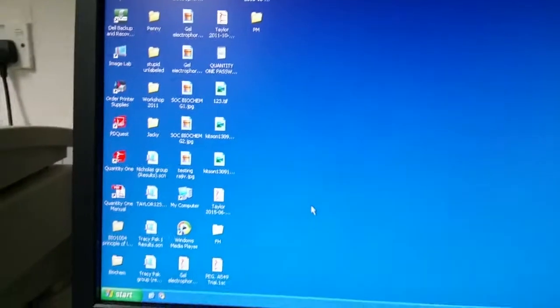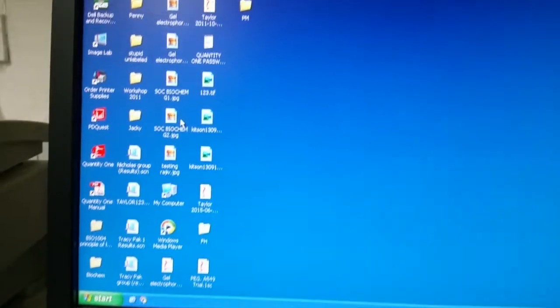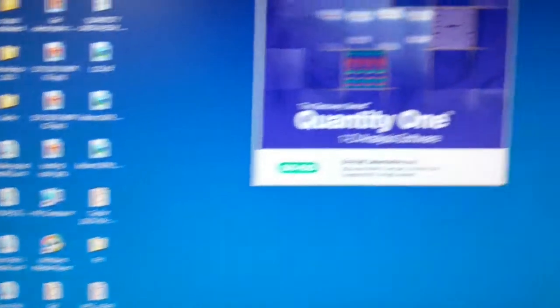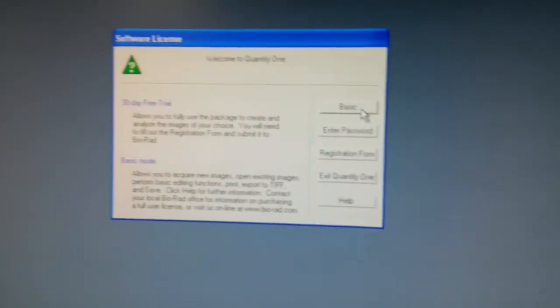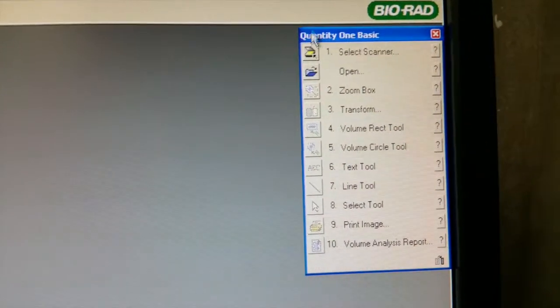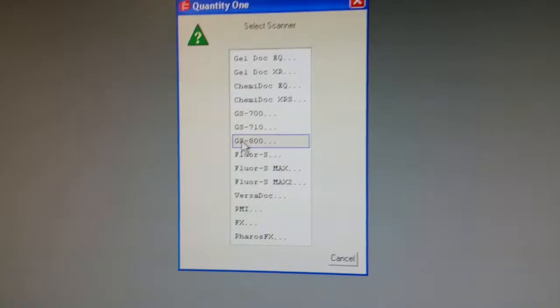Now we move on to the software part. You need to have the software installed — in this case we are using Quantity One. You can download it online as well. Choose Basic, then go to Select Scanner. Our model is GS-800, so we select that one.